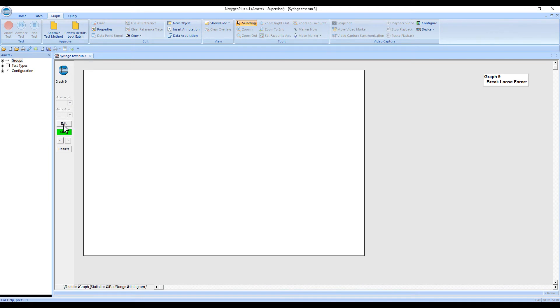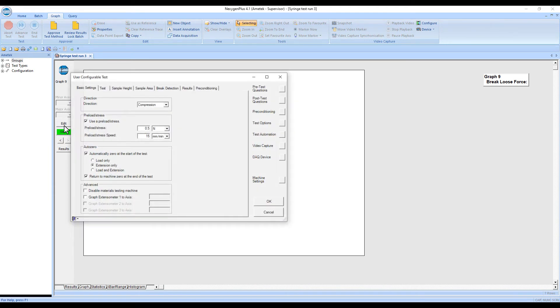The workflow begins with creating a method. After changes are made, the user enters the reason for the change and adds their electronic signature.